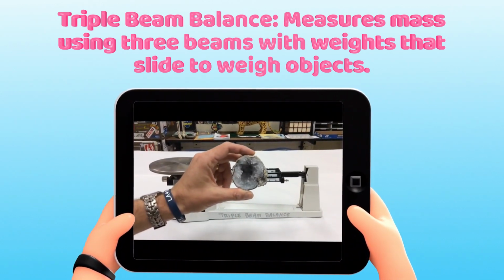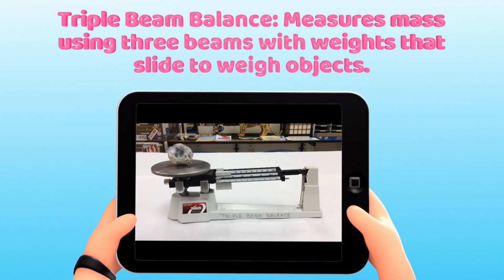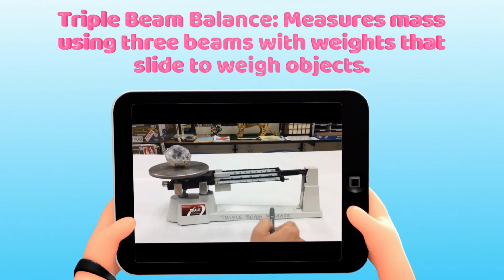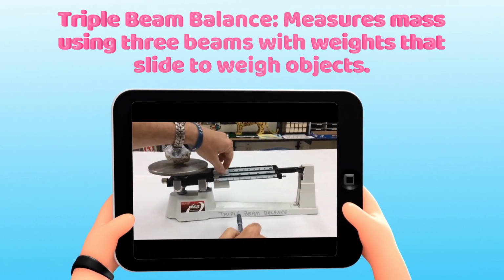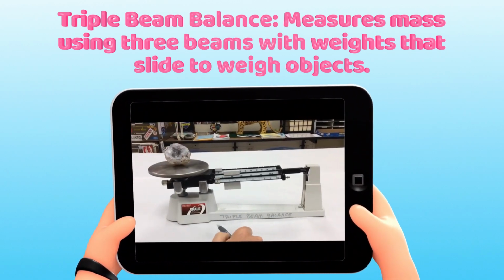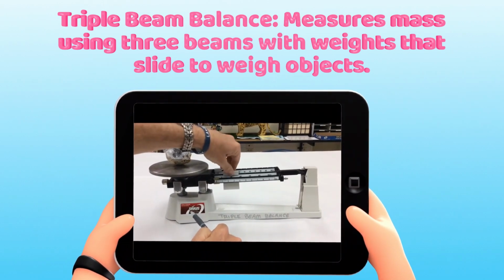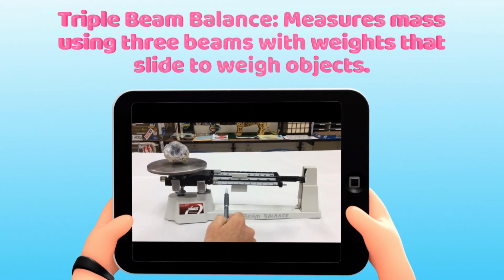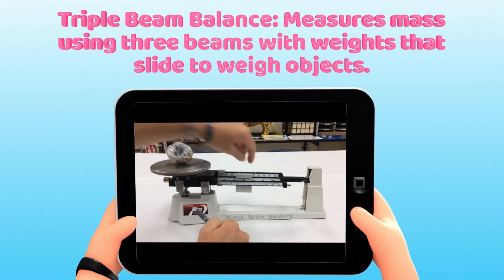For example, as you can see there, when we are reading, we must start from the middle part. Then we will go to the upper part. Then we will go to the lower beam. Once you get the readings, you will add them together to get the measurement. For example, here, it will be something like 179.4. So that is how we read the triple beam balance.